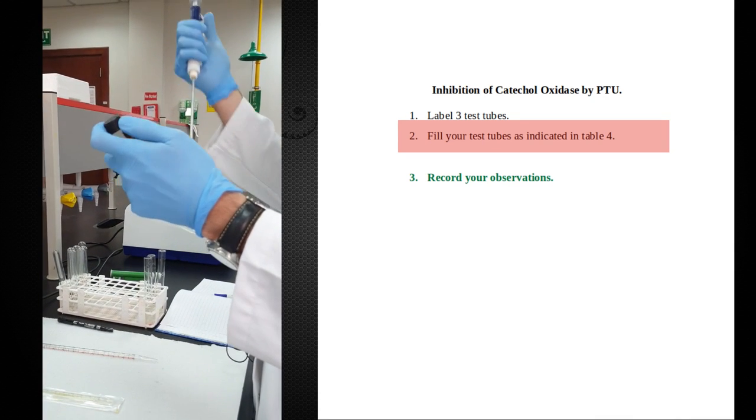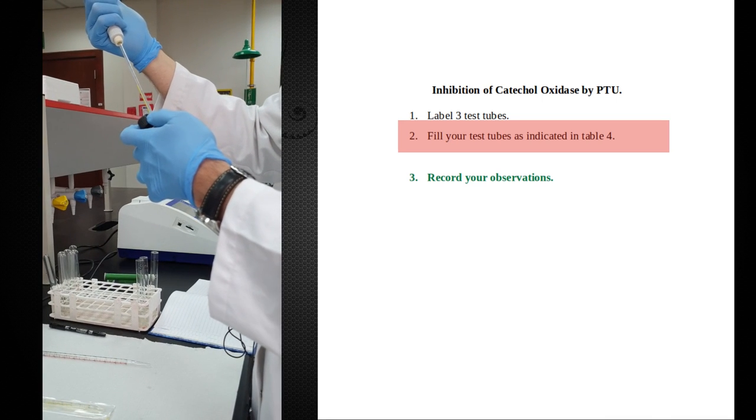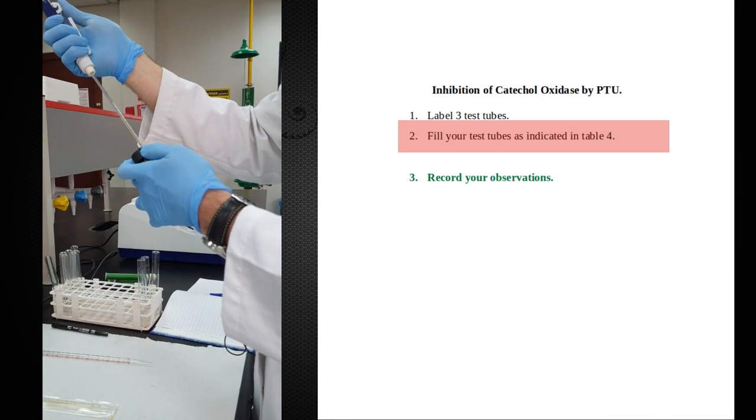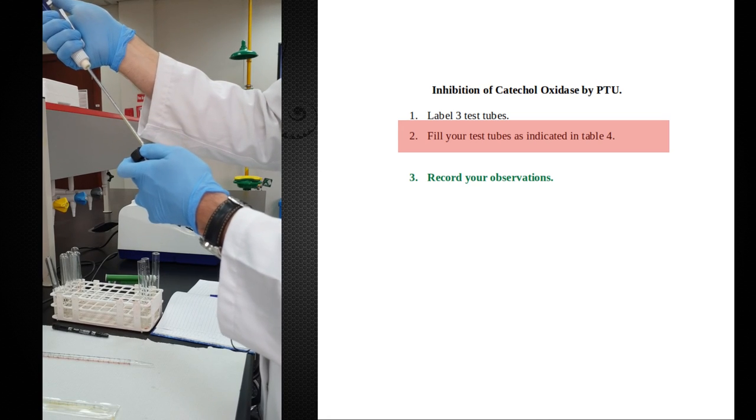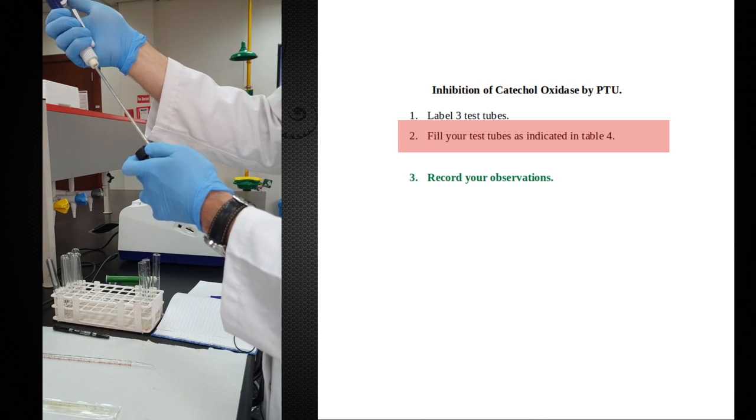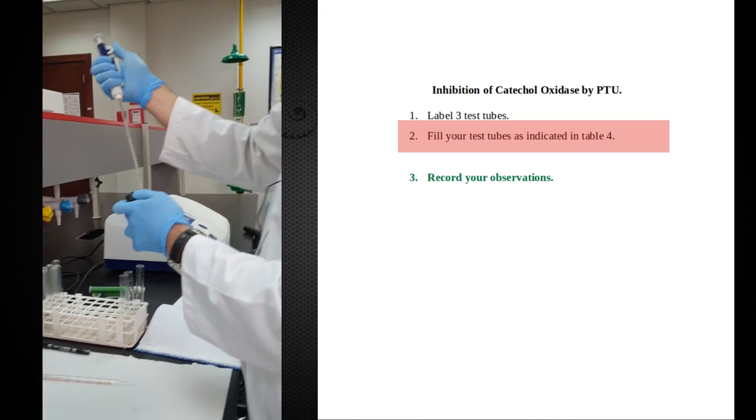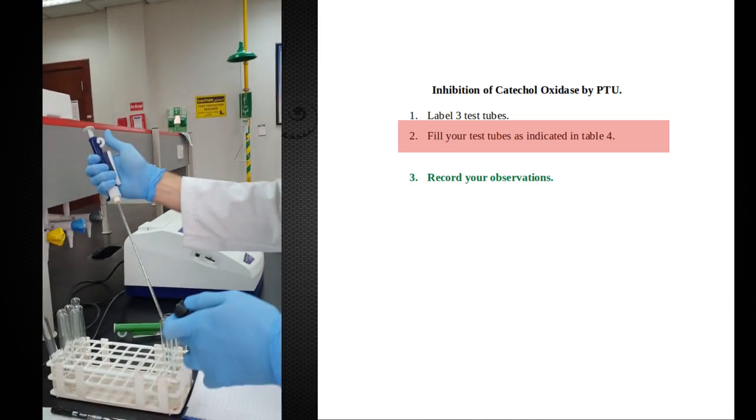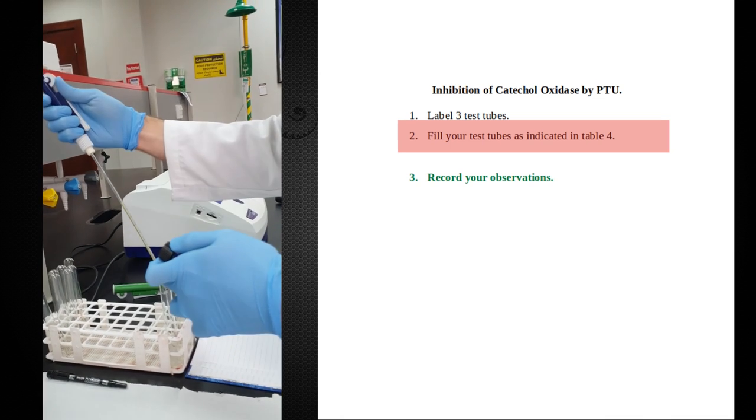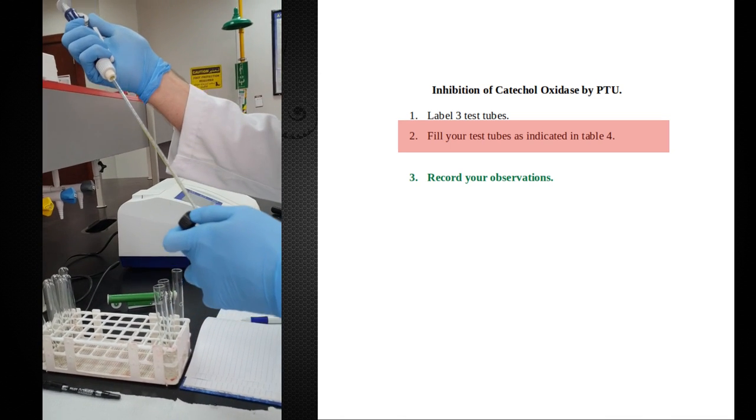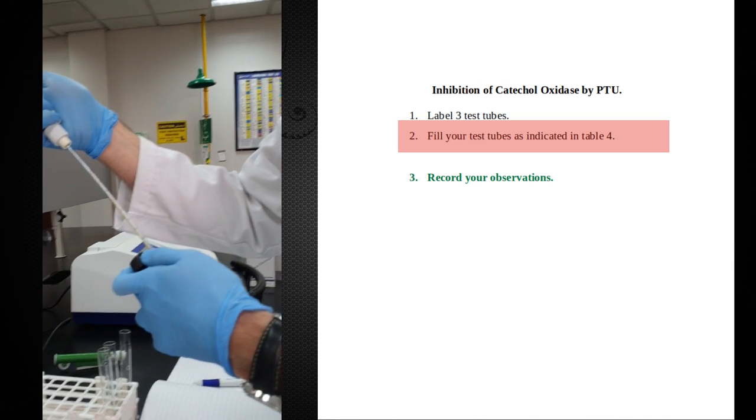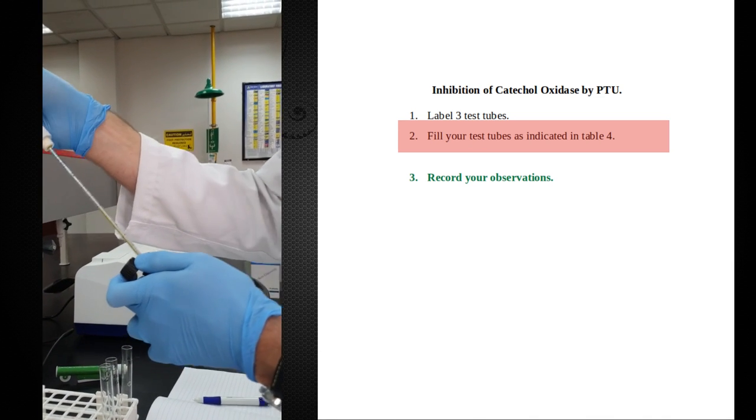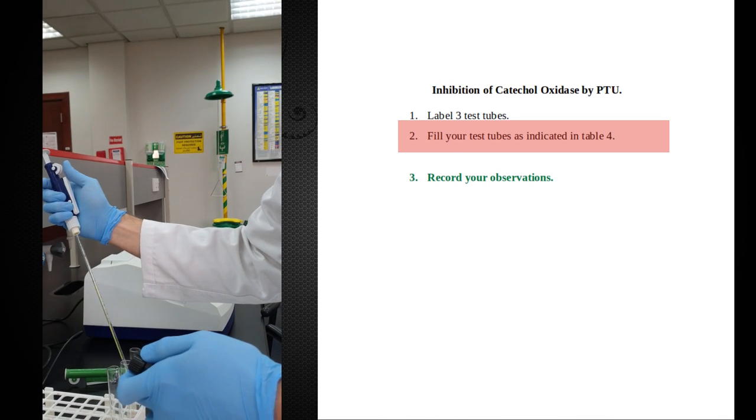I've got the PTU. It's the inhibitor. I'm going to take half a milliliter again, up to the 0.5 mark. Adding to tubes one and two.